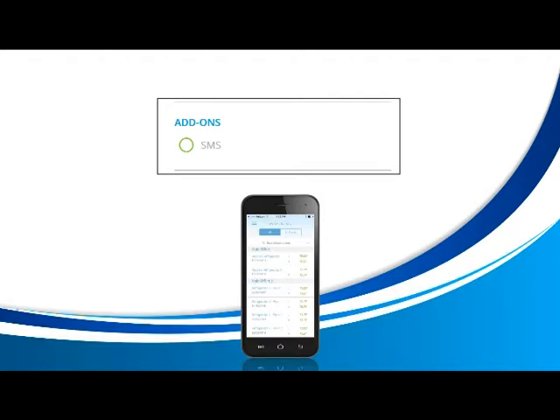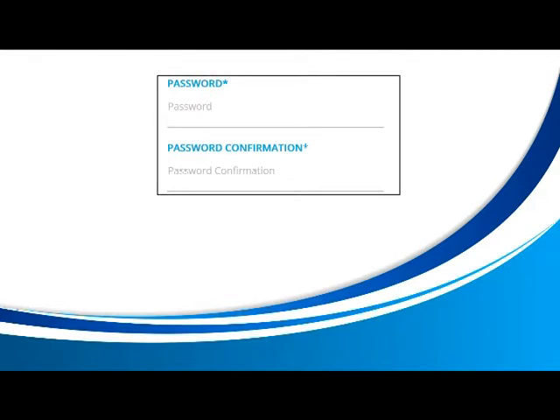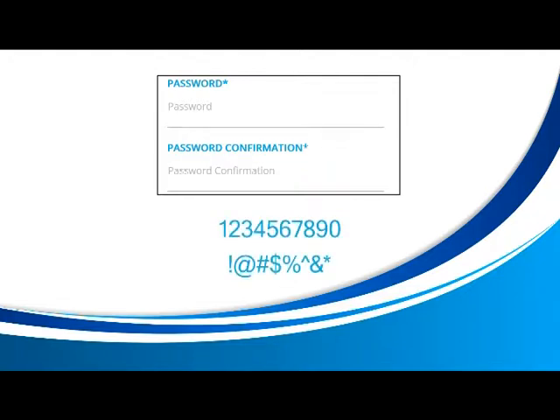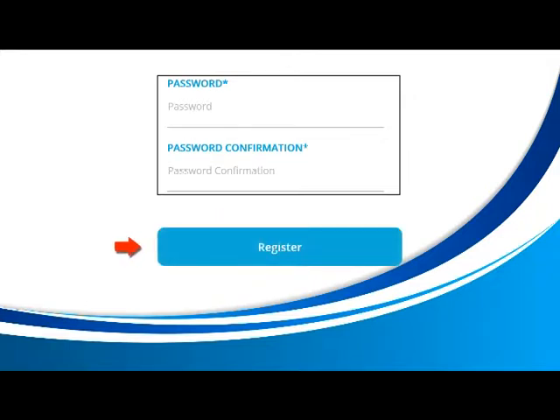Next is add-ons. Add-ons are optional extra features you can add to your account to enhance your Traceable Live service. Choosing the SMS add-on will allow you to receive text message notifications straight to your phone for your Traceable Live devices. Enabling SMS is only $2 more for each Traceable Live device. If you prefer not to have SMS enabled, be sure to have this button unfilled before you continue. For password, to keep your account as secure as possible, Traceable Live requires a password with at least one number and one special character. Be sure to do this when entering a password or you'll be asked to fix this before continuing. Once you're done, go ahead and click register and your account will be created.